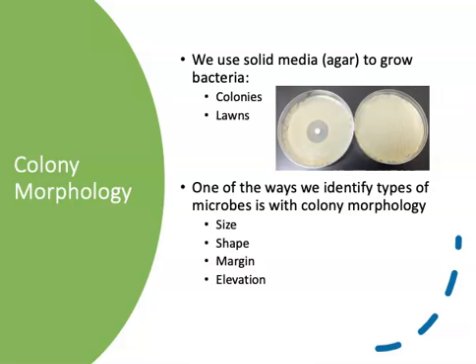All of the cells are clones of the parent cell. In other words, the parent cell has started to divide and produce daughter cells asexually until a whole pile or mass of genetically identical cells is sitting in this visible colony.